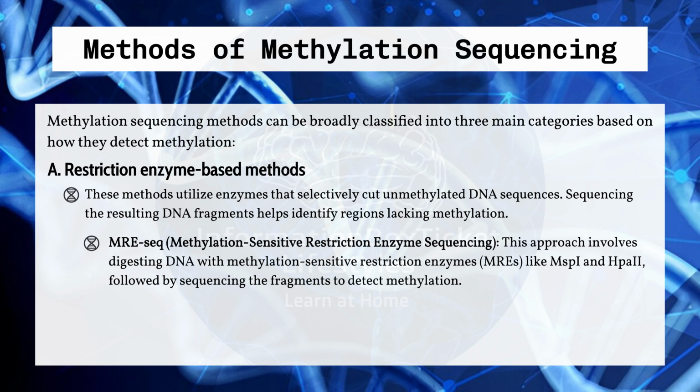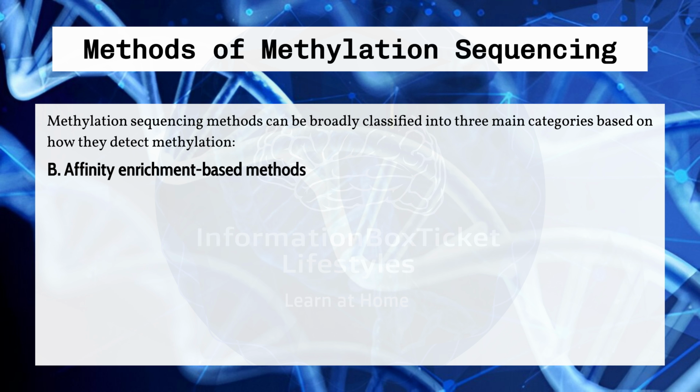MRE-seq, methylation-sensitive restriction enzyme sequencing. This approach involves digesting DNA with methylation-sensitive restriction enzymes, MREs, like MspI and HpaII, followed by sequencing the fragments to detect methylation. B. Affinity enrichment-based methods.